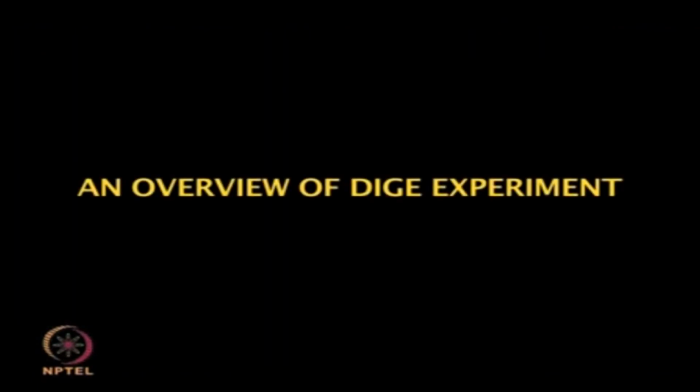Yes, there is another video where you can see now. This is the second video which you can see more elaboratively. This is particularly a protocol which is developed for membrane protein analysis. Now you can see this video.